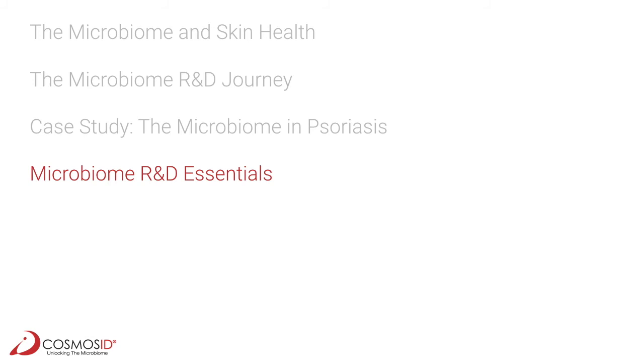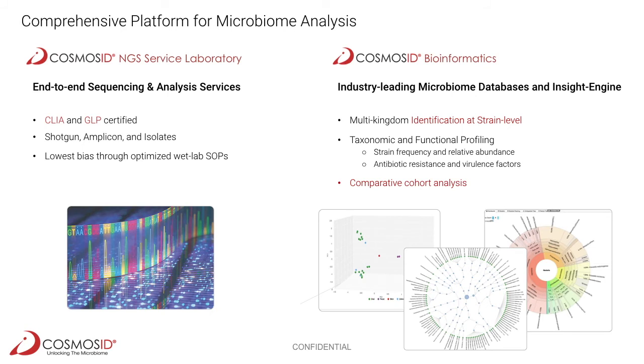So with that, let's switch to the last part and recapitulate different R&D essentials required for the development of microbiome-based skin health interventions. We believe it is very important, if you carry out microbiome analysis, to control the entire end-to-end workflow, beginning with sample collection, preservation, storage, DNA extraction, library preparation, sequencing, and analysis, as all these steps are interdependent and can affect the outcome at the end.